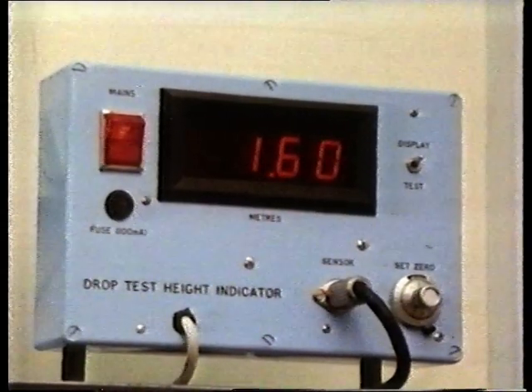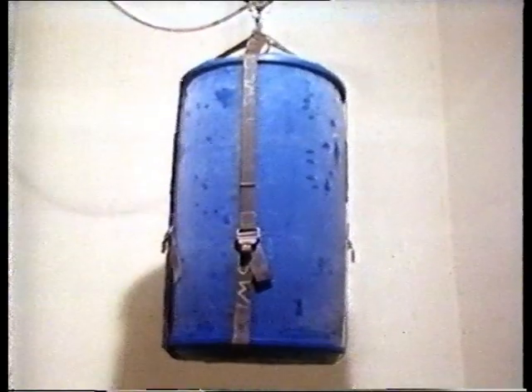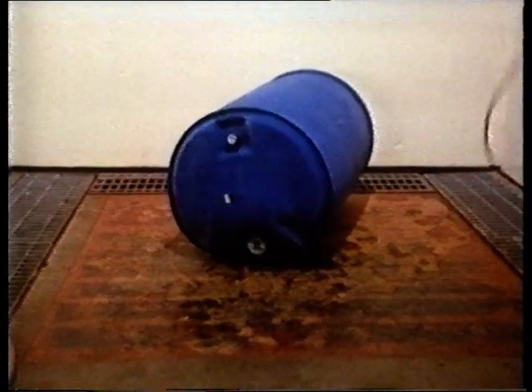This polyethene barrel, filled with antifreeze solution, has been stored at -18 degrees C. Has it become brittle? Here's one kind of test. It's dropped onto a rigid surface. The test was carried out a number of times with the barrel falling at different angles. It distorted, but it didn't burst.